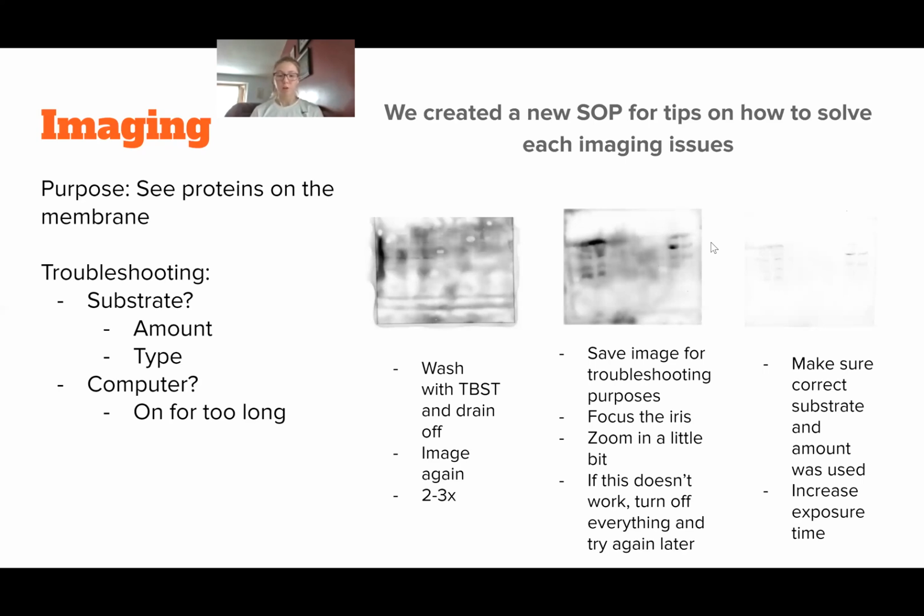So when using the polyclonal, like I said before, we like the results from the second or fourth use because it was much cleaner. There wasn't as much background. And because we're not using it for the first time, you'd want to use femto for that second to fourth use of the polyclonal.